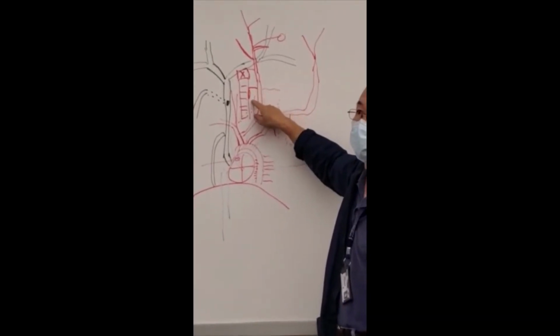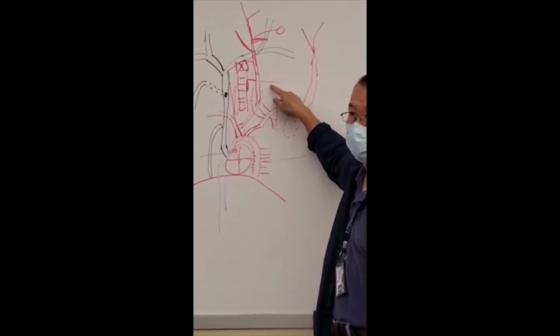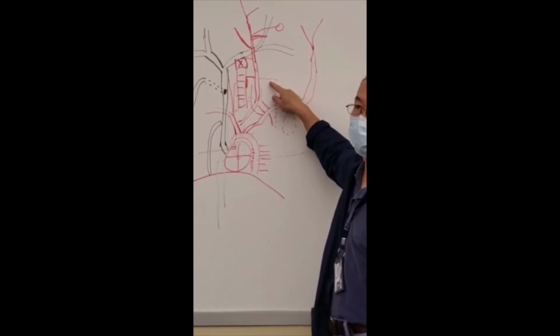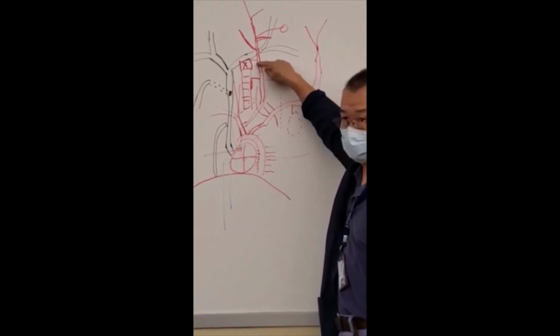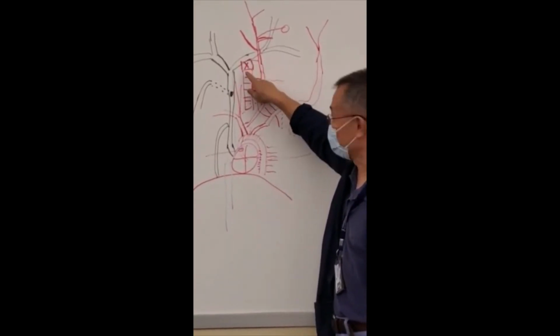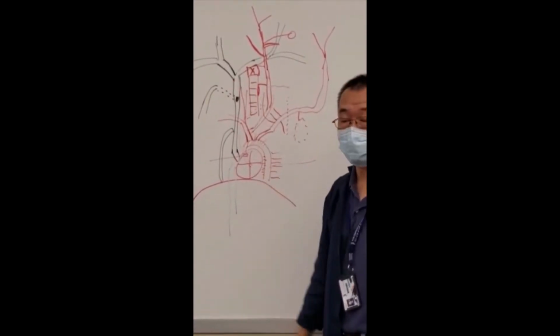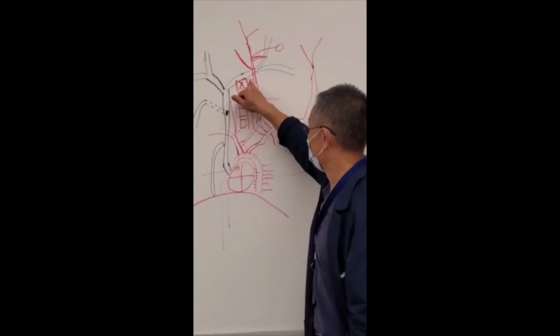It's on top of the thyroid gland. On the bilateral side, it has one branch supplying the neck muscles, because this is muscularis. Then going up, you see a tiny branch supplying the larynx, because this is laryngeal. It's small. Many of the cats get damaged at this one.